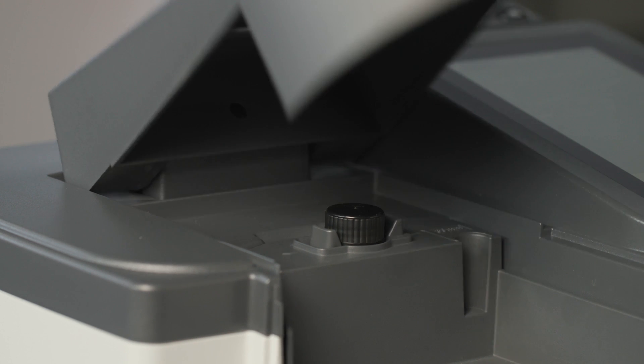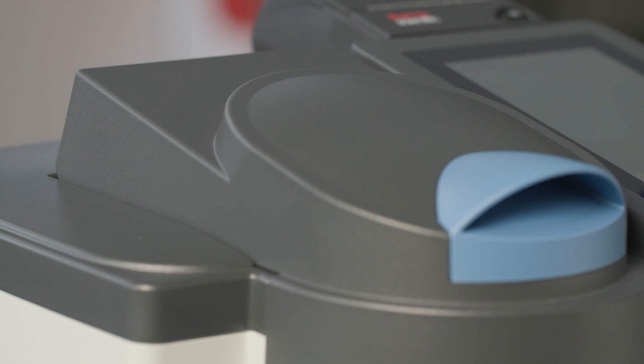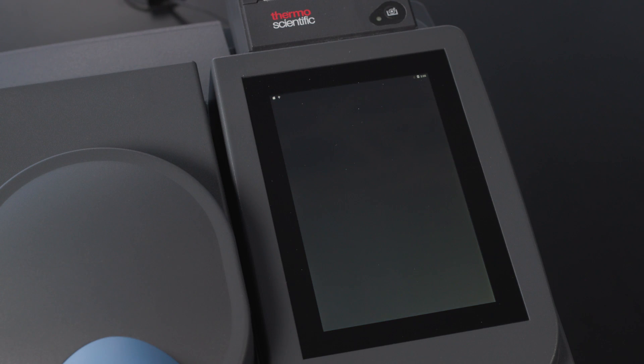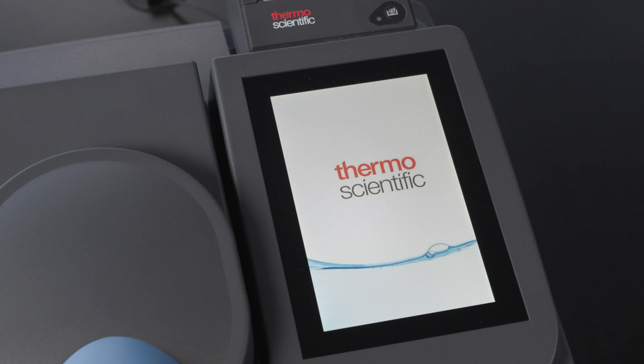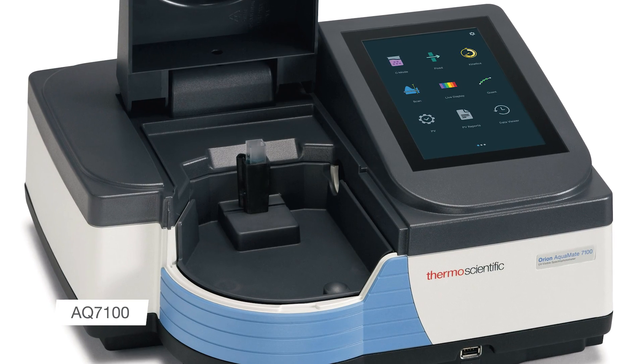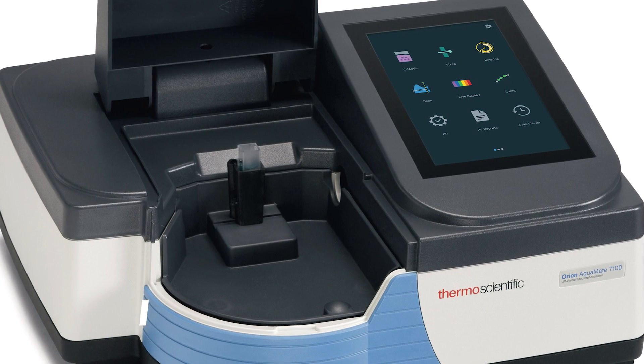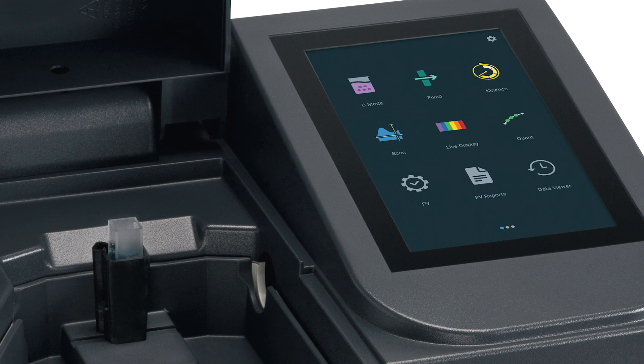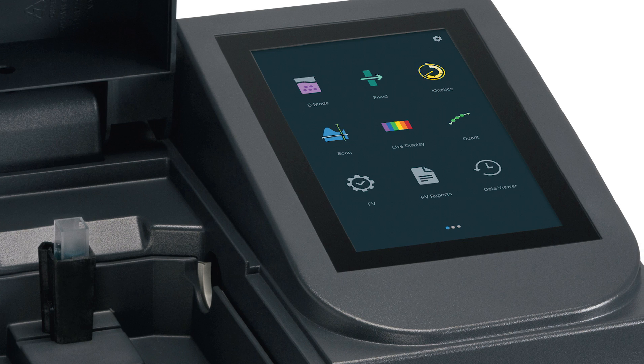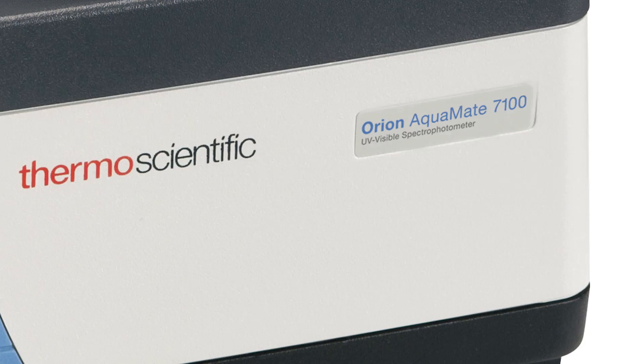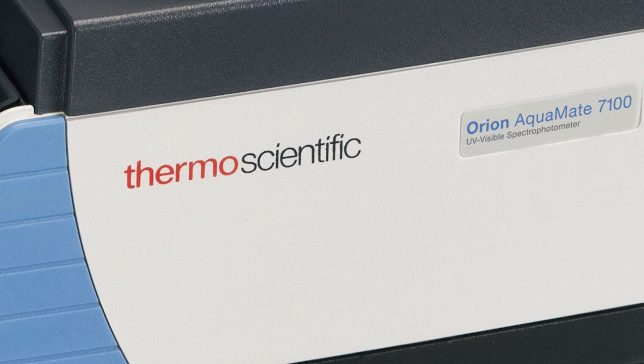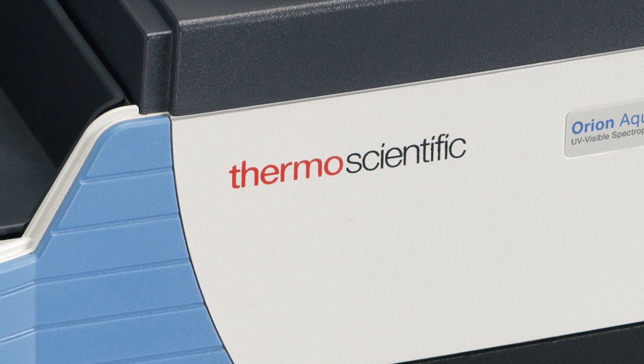The benefit of a xenon flash lamp is that it has a much longer life and doesn't require a warm-up time. If our laboratory uses a spectrophotometer infrequently, the AQ7100 visible light spectrophotometer may be a better value, but it's important to remember that the AQ7100 requires approximately 30 minutes to warm up, and the tungsten halogen lamp doesn't last as long as the xenon lamp in the AQ8100.